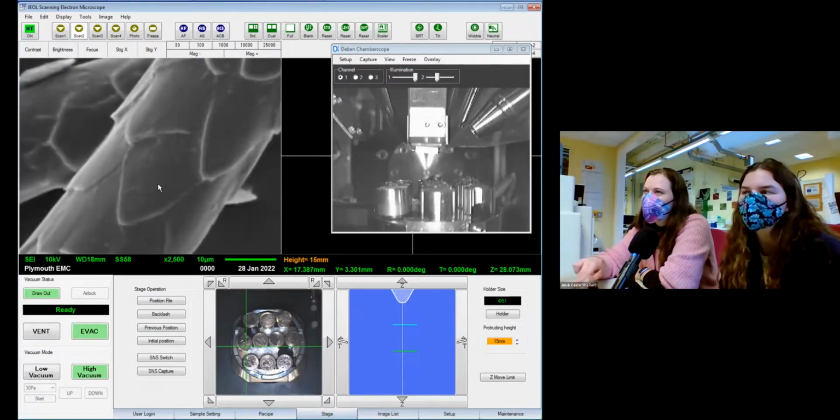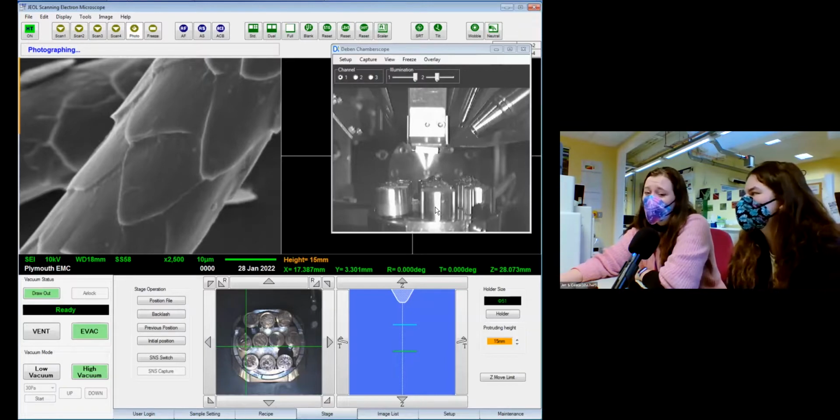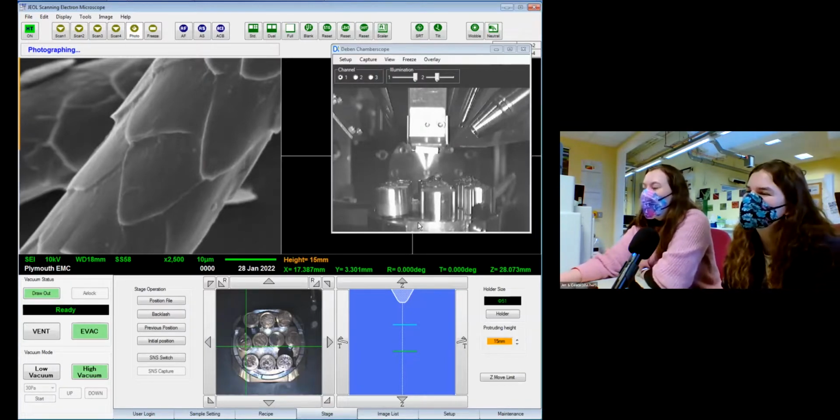All that grinding noise you can hear in the background, that's me spinning the focus. The dials we have on the control pad for this one are phenomenally loud. If anyone is doing anything on this microscope, you can hear them from the rest of the lab. Can confirm. This one's quite old. As the stage inside moves around this little block, particularly as it goes up and down, it just sounds awful, grinding away. But it works, and of all the microscopes, it's a very user-friendly one. This is one of our good training microscopes. Not quite in focus, but I think it's good enough.